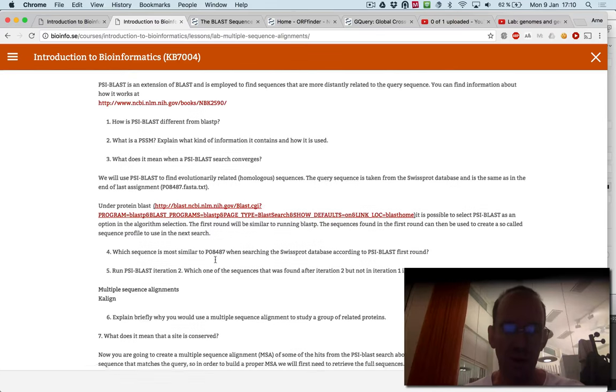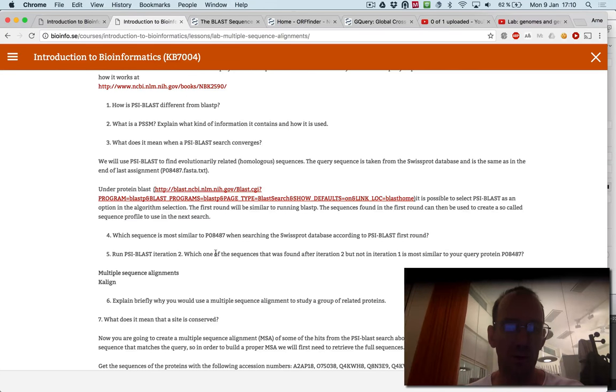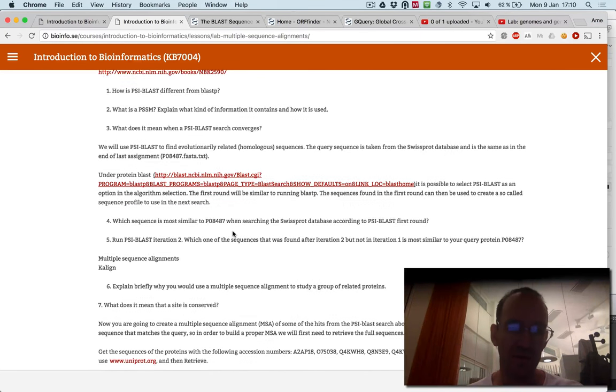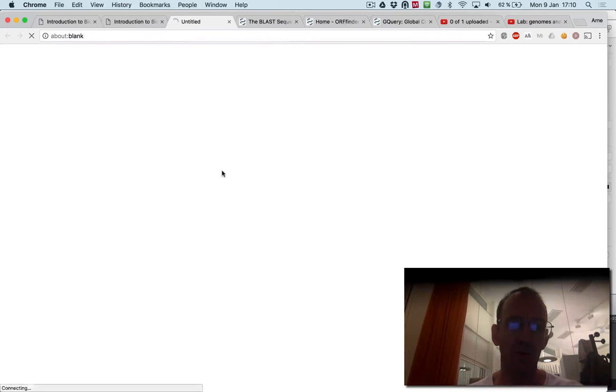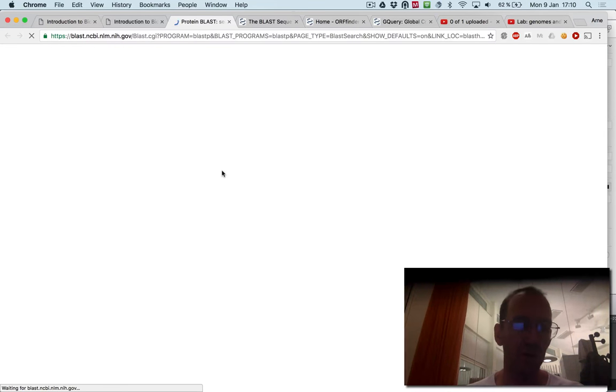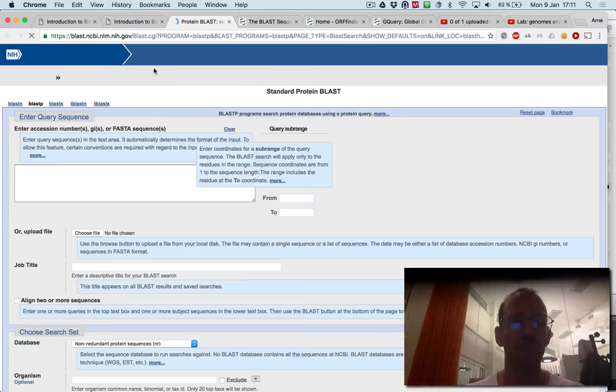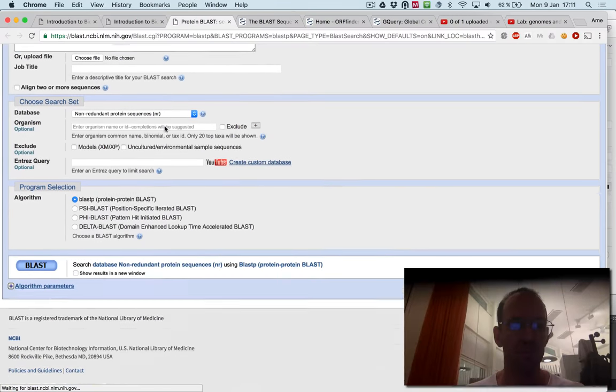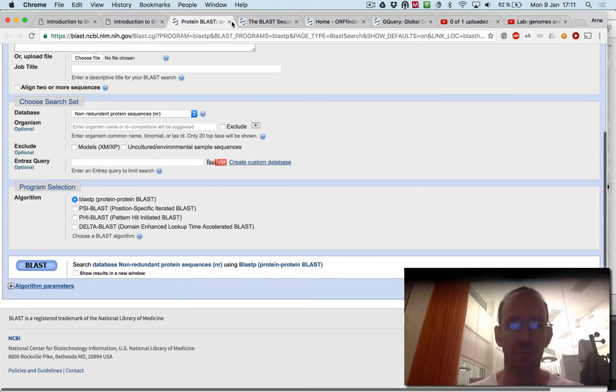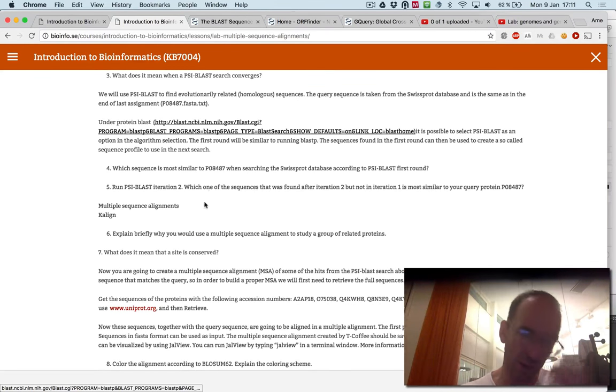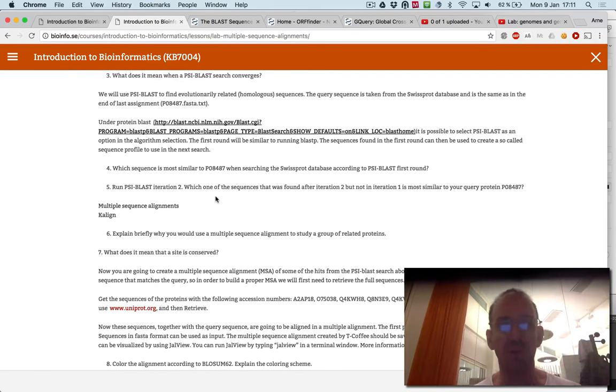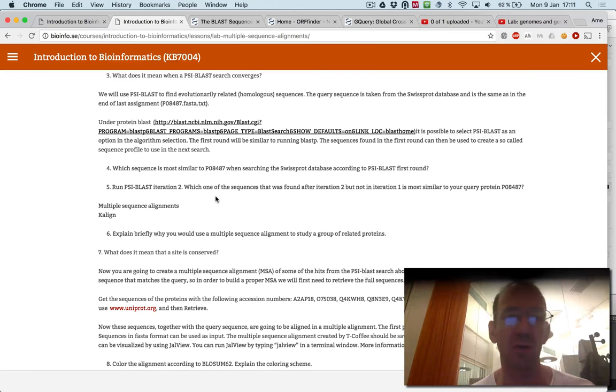Secondly, you can run PSI-BLAST on the web page. Let's go to the page, and we have demonstrated earlier how to do that. You should run several iterations and see what happens with every iteration.